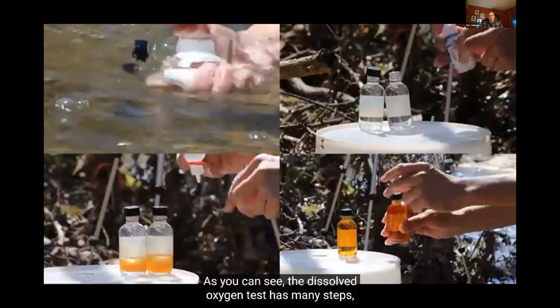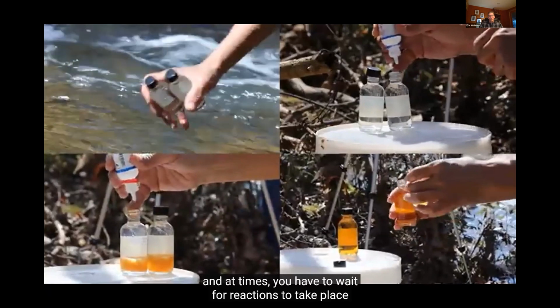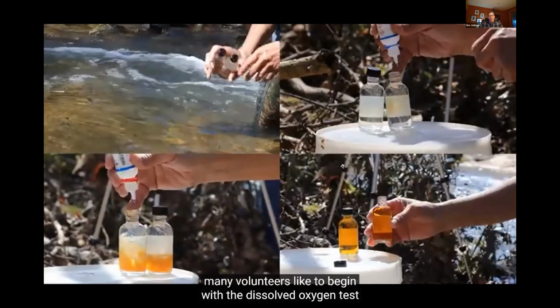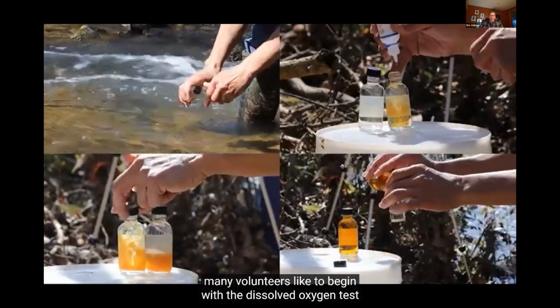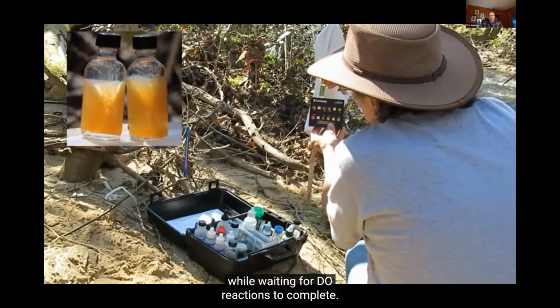As you can see, the dissolved oxygen test has many steps, and at times you have to wait for reactions to take place between the steps. For this reason, many volunteers like to begin with the dissolved oxygen test so that they can move on to the other tests while waiting for DO reactions to complete.